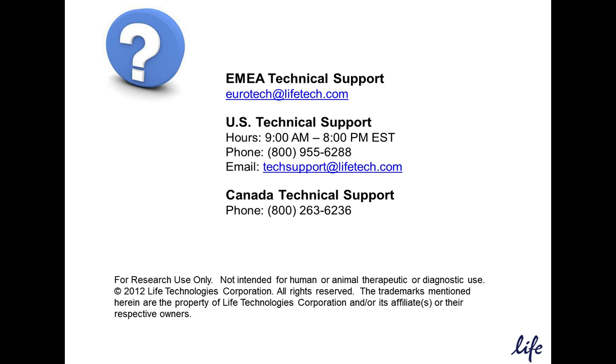So there is a question, how is MFI calculated? This is the mean fluorescence or median fluorescence intensity, and this is a value that is calculated by the flow cytometer and the software system.